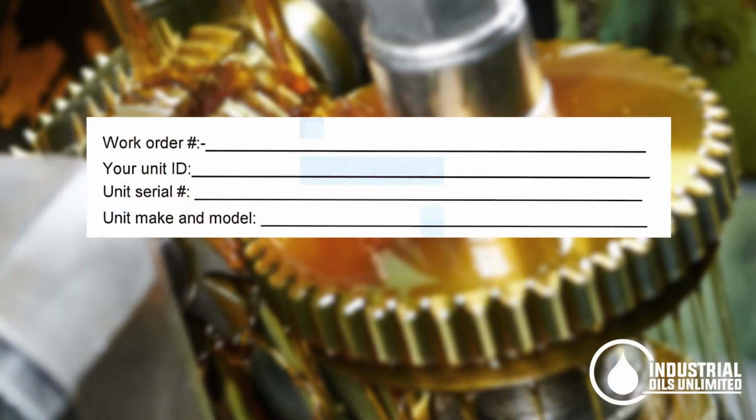So let's take a closer look at the ALS form. Note that the Polaris Labs form asks very similar questions, but it's typically completed online. We'll start with providing the work order number and the unit ID. The unit ID is important so that results can be tied back to a specific unit if there is an issue. The serial number, make, and model information provides the lab with important details.